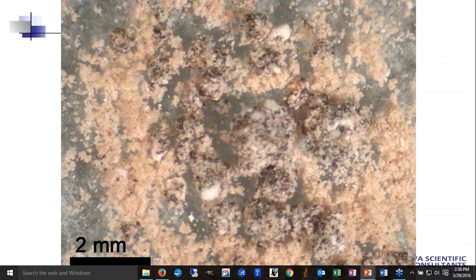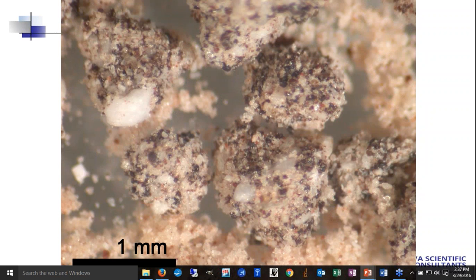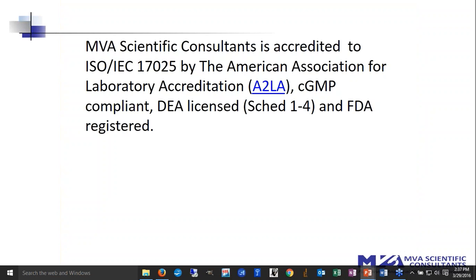We were able to sit with a stereo microscope and isolate several milligrams of these darker particles, send them off for analysis for steroids, which came back positive, identified the steroid present, and then go back and demonstrate that, yes, indeed, these were present in the protein powder and they're not typical of the particle types in the protein powder. Higher magnification view there. A bit tedious, but it definitely helped the sensitivity of the process.